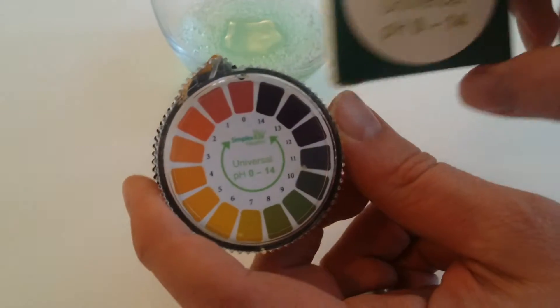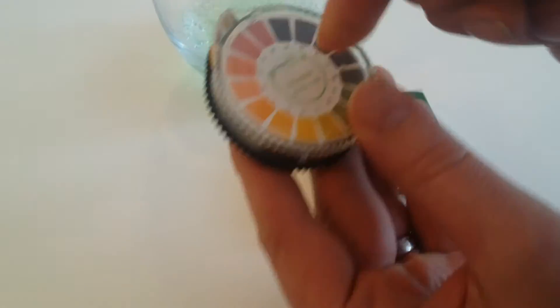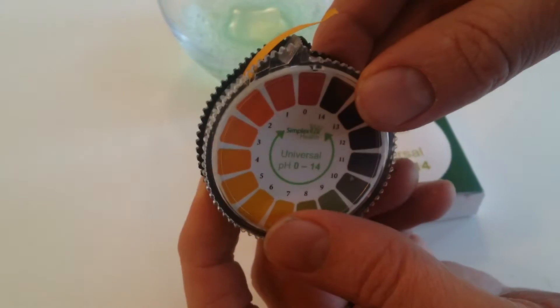When you get your litmus paper it comes in a little box like this. Obviously make sure you first of all open it up, unwrap the foil, pull the litmus through, and then you can just tear off a little piece.